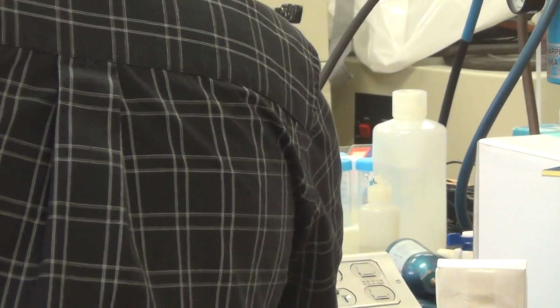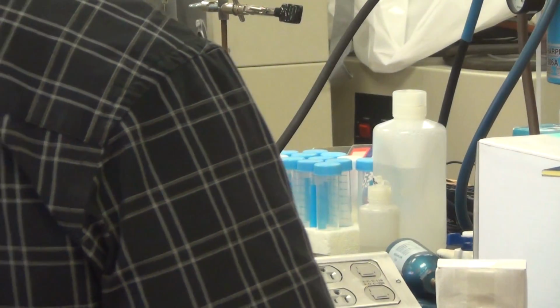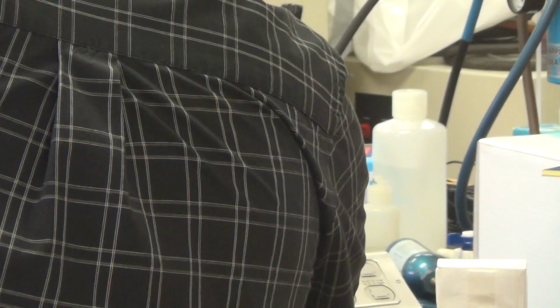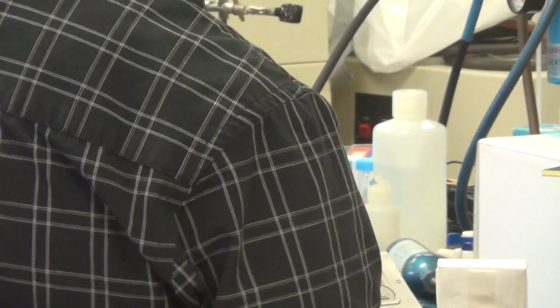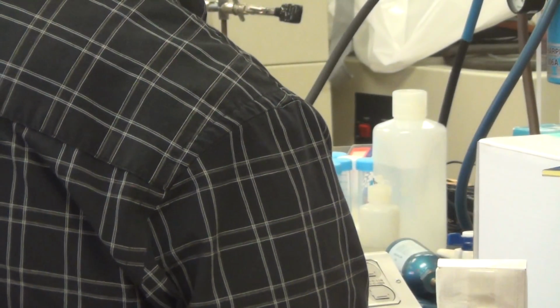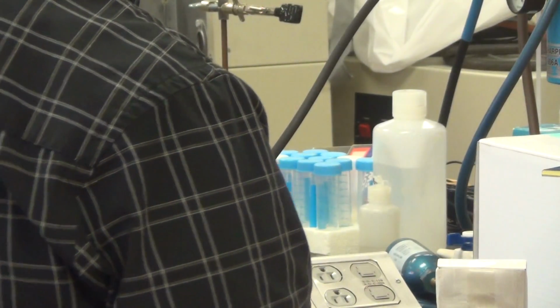It's still doing it. It said okay, but I remembered that I had interlock. Yeah, the interlock was you had no power. So we're chip. It's got green chip. Then you can see that's where the base module is, where it picks up things. We're running right now a copper demo. We don't have any sample information file, and the data set we're saving to is demo.